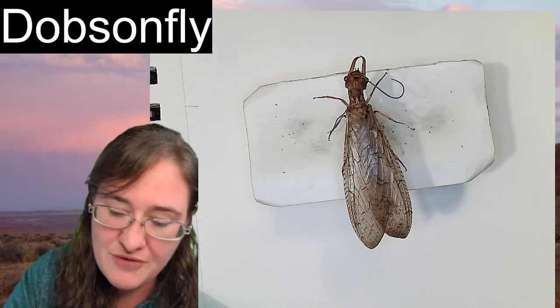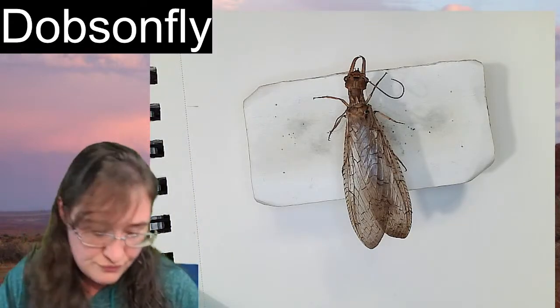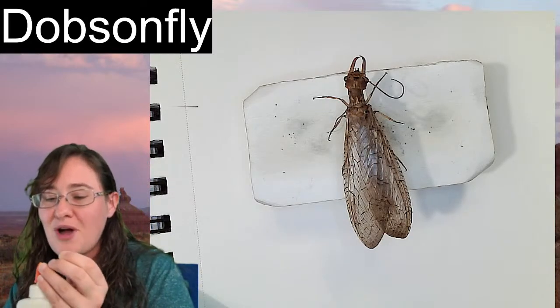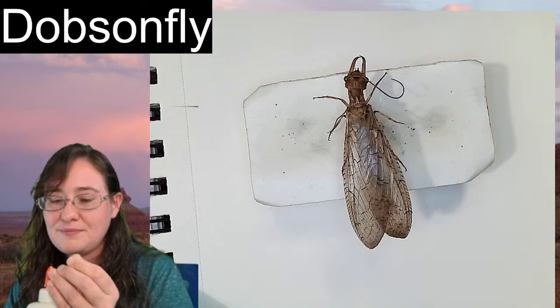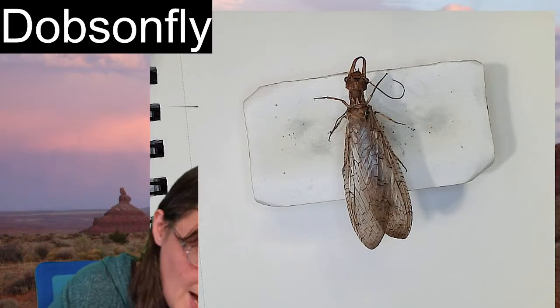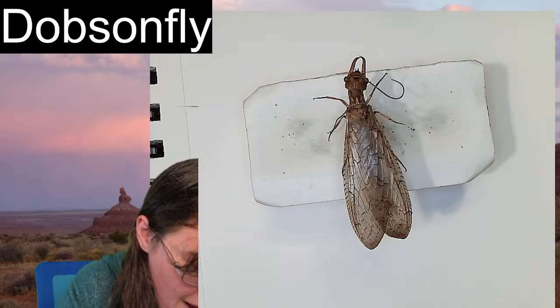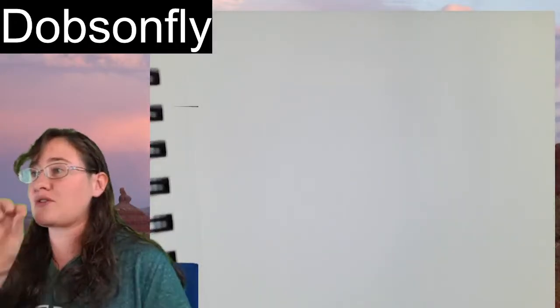I just knocked one of our Dobsonfly's antennae off with my ruler. I looked up for 1 second and my hand shook. So, our Dobsonfly, I'm just going to give you the number that I was thinking, is about 5.5 centimeters long. We're going to be gluing its antenna back on under the microscope together.